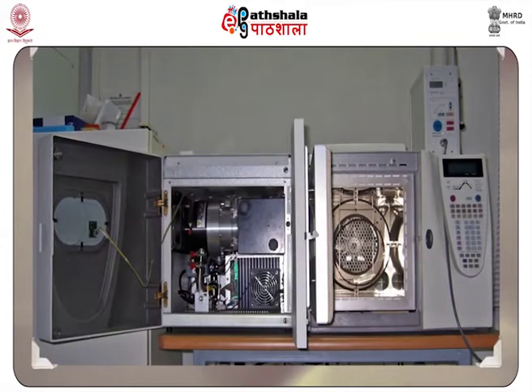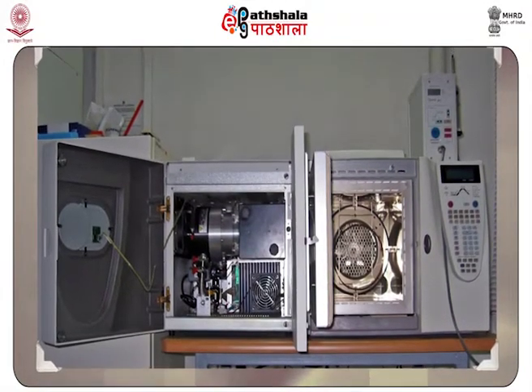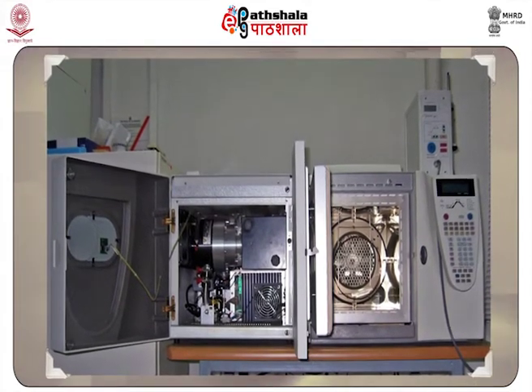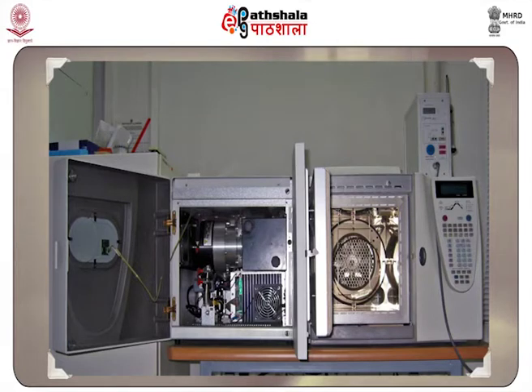Now, the basic principle of GC is similar to other previously mentioned chromatographic techniques. It has various marked differences too. Firstly, in GC, the mobile phase is a gas and the stationary phase is liquid, whereas in column chromatography, liquid acts as the mobile phase and a solid as the stationary phase. Hence, gas liquid chromatography is the full name of this technique.